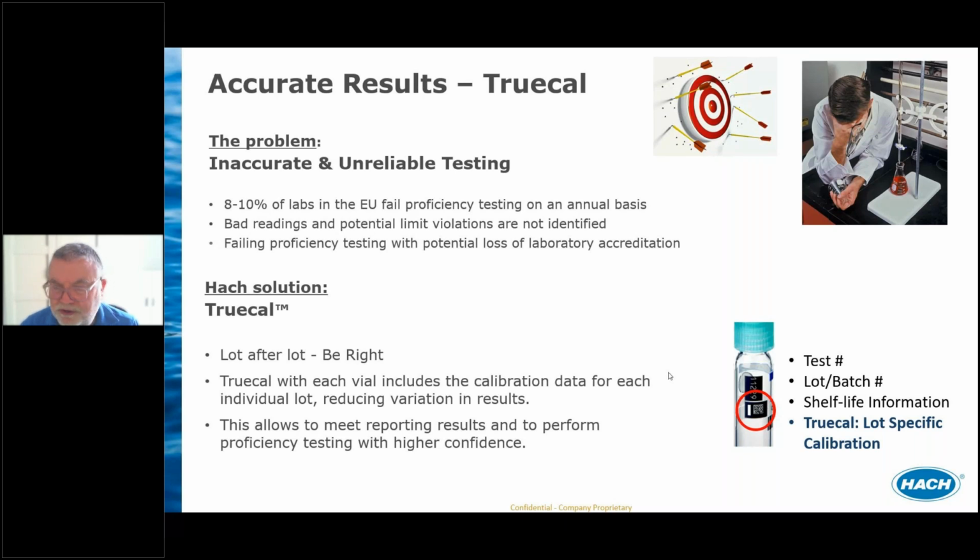Without the TrueCal function, the instrument will use the standard calibration curve, which is adapted for all batches, but we will increase the accuracy if we have the TrueCal feature, which adapts the calibration curve for each batch.